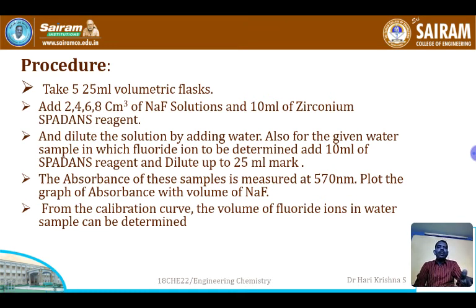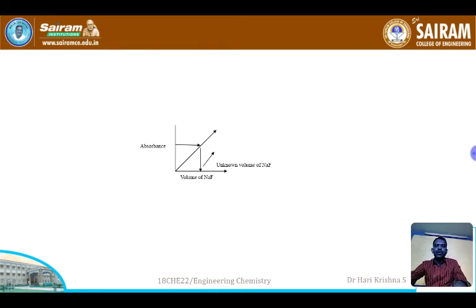So we are going to plot a graph, absorbance versus volume of sodium fluoride, and we are going to determine the calibration curve. So volume of fluoride in water and absorbance will be drawn. From that we are going to determine the amount or volume of sodium fluoride present in the test solution. So the calibration curve is as follows, that is absorbance versus volume of sodium fluoride.